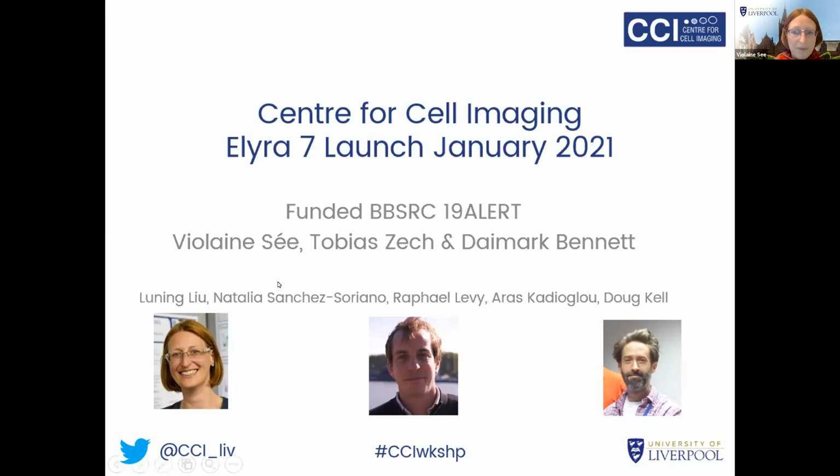Just to introduce a bit this morning, as probably many of you know, Liverpool has been successful in a BBSRC alert grant. And thanks to that, we have been able to install the Elyra 7 from Zeiss back last October, November, and training has just been completed this week, and the installation is under completion as well. So now it will be open for people to use it. So this is why we thought it would be a good time to introduce the system this morning.